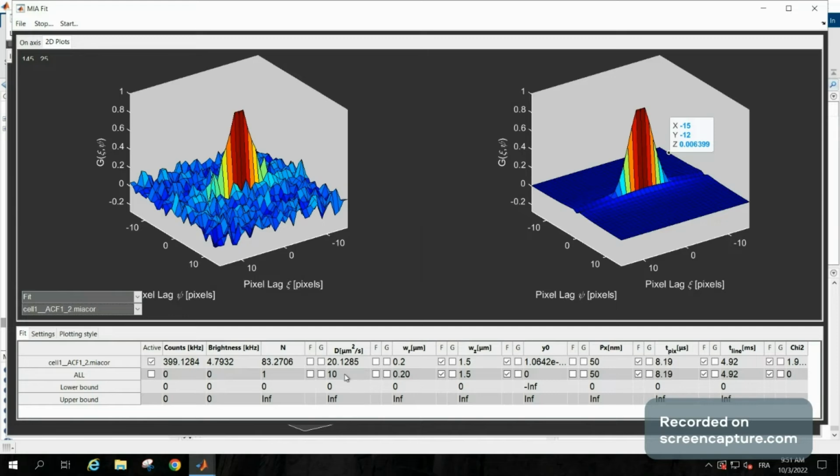What you also notice is that it shows you the number and brightness, which gives you a fair idea of the oligomerization state of the protein. And for EGFP, it's normally around 5 kilohertz, which also seems to agree with the literature here.